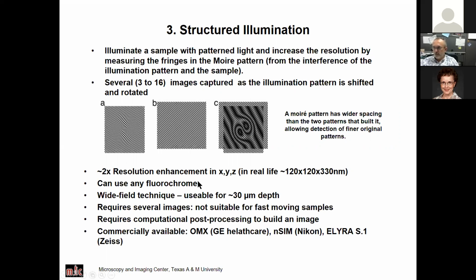But the advantage is that you can use any fluorescent dye, just your regular dye. You don't have to do anything much special about the sample besides making sure that it is well prepared. But it's a wide field technique, so once the samples get thicker, it's not working that well because then you have a higher background, image blur. But you can buy these systems commercially.